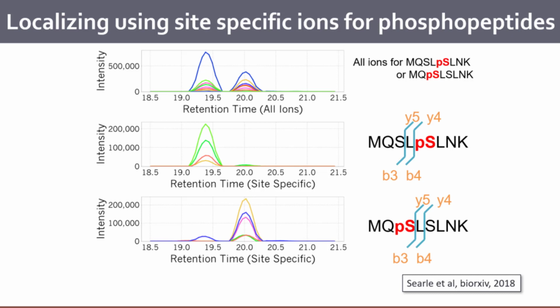But there's no chance of doing this without having this retention time information. We can actually begin to get a sense of how big of an issue it is by having this data, because this retention time information means it belongs to this molecule when it was separated from the site.